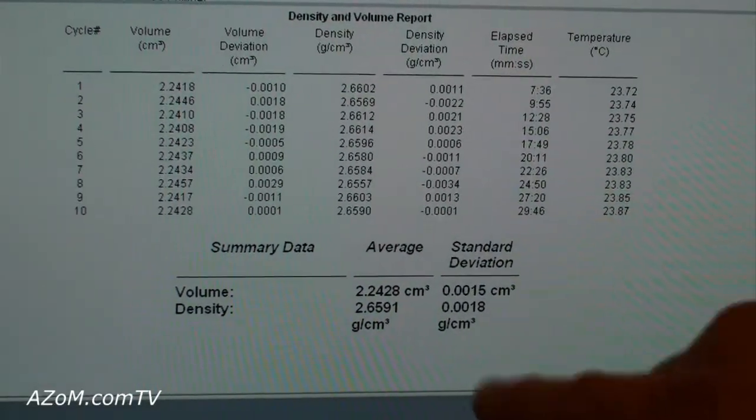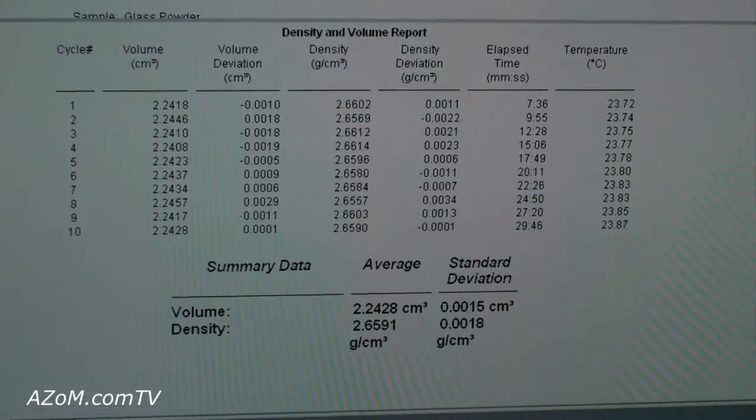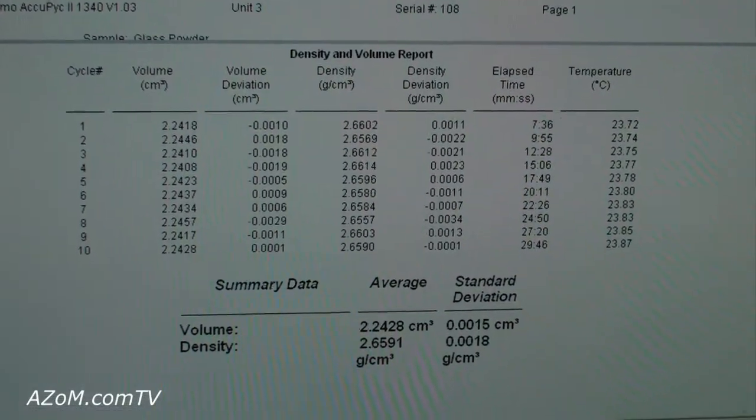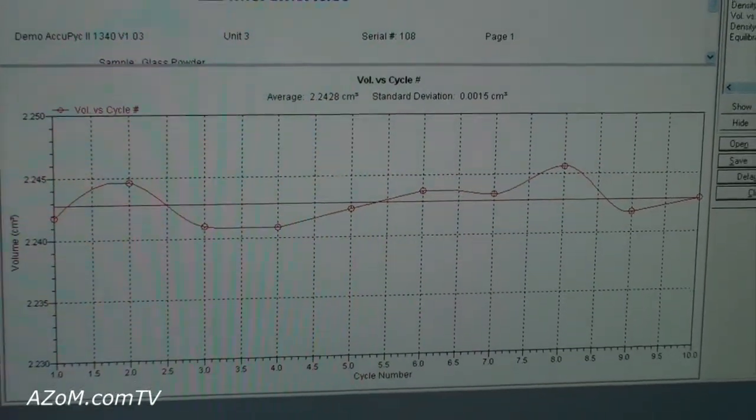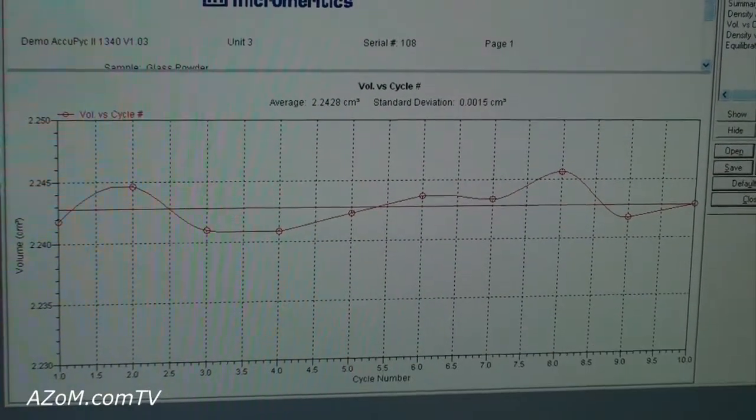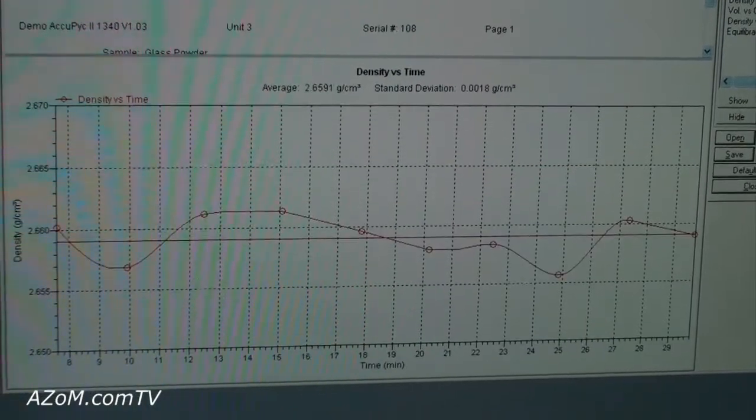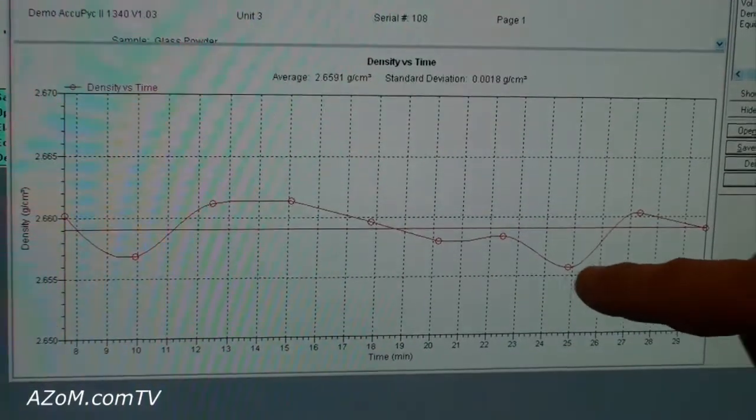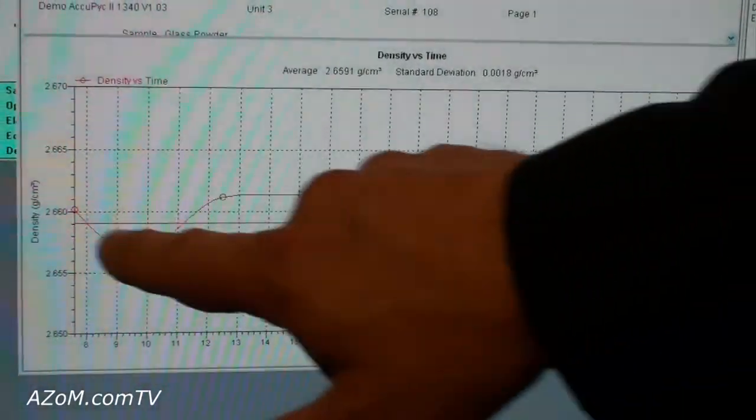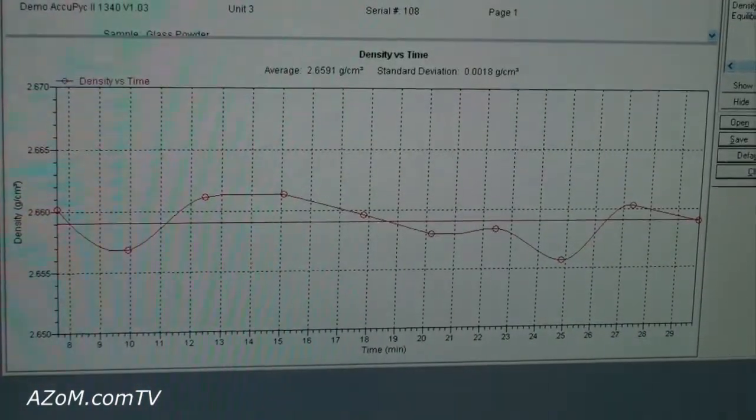In this particular example, we have got a plot of volume versus the number of tests, as well as density versus the number of tests. And this is what you are seeing in both of these is the actual test points of each of the 10 replicates and the average value for these tests.